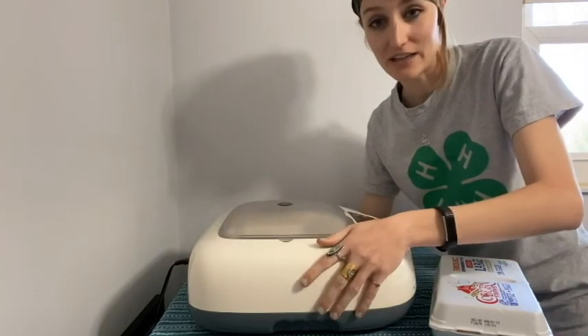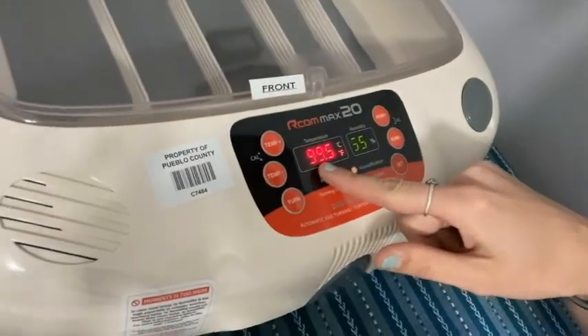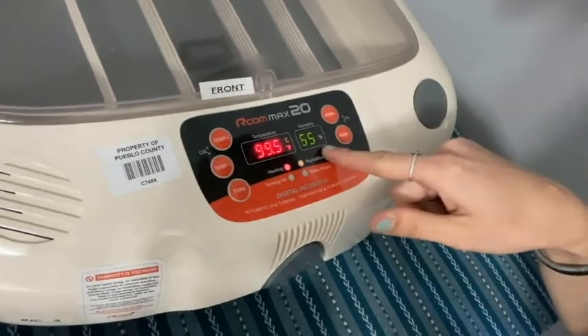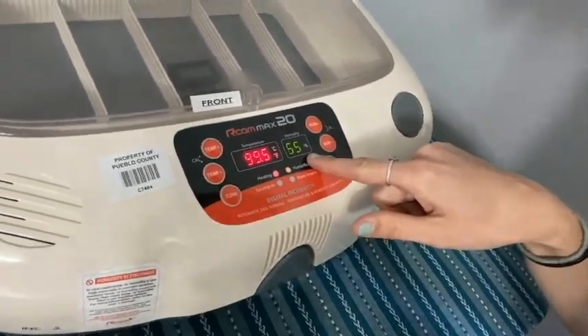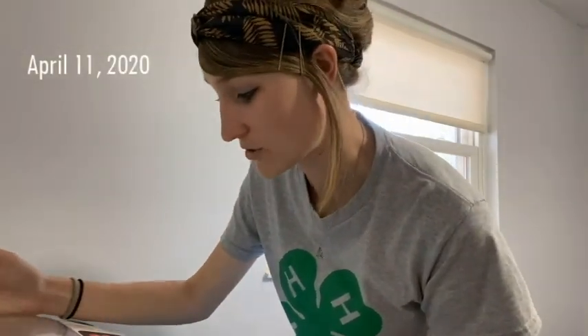So we have an incubator here, and we like to keep our incubator at 99.5 degrees Fahrenheit and 65 percent humidity. Hatching eggs need a very warm environment to hatch, and they need a humid environment as well. So this incubator got plugged in yesterday — it's been prepping overnight — so it's now reached the temperature where we can add our eggs into the incubator.